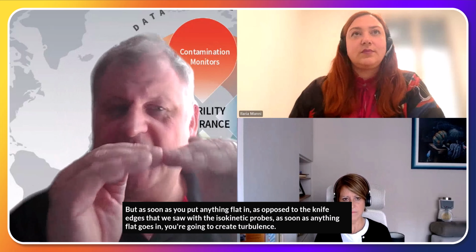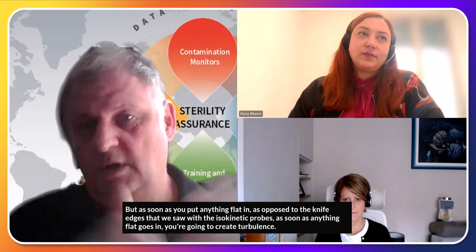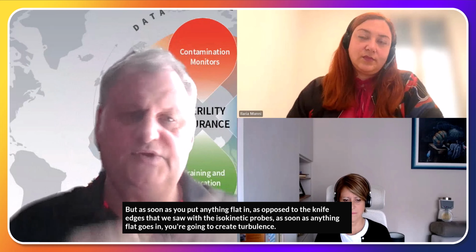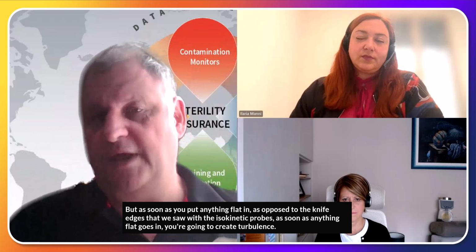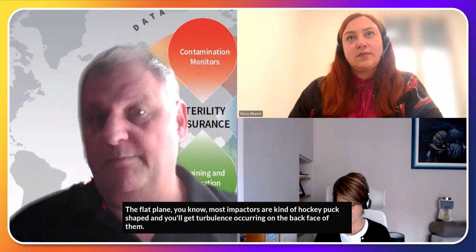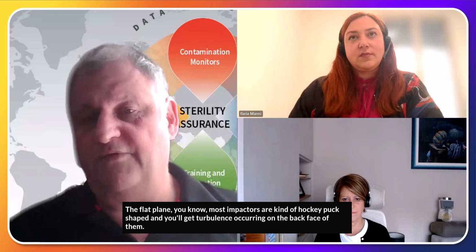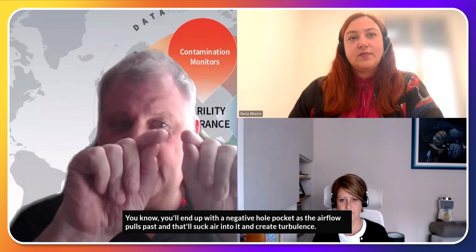But as soon as you put anything flat in, as opposed to the knife edges that we saw with the isokinetic probes, you're going to create turbulence. Most impactors are kind of hockey puck shaped, and you'll get turbulence occurring on the back face of them. You'll end up with a negative pocket as the airflow pulls past, and that'll suck air into it and create turbulence.